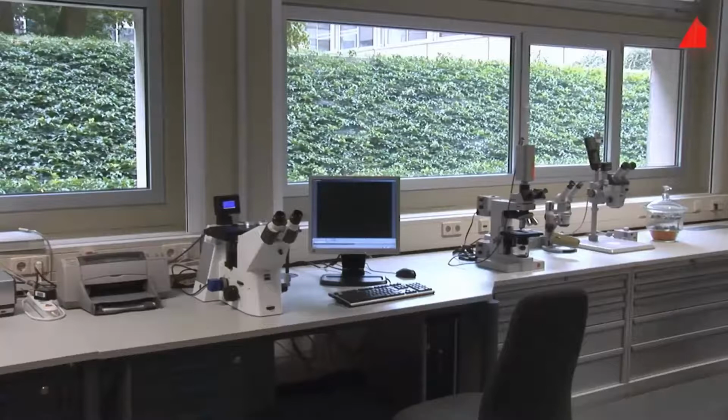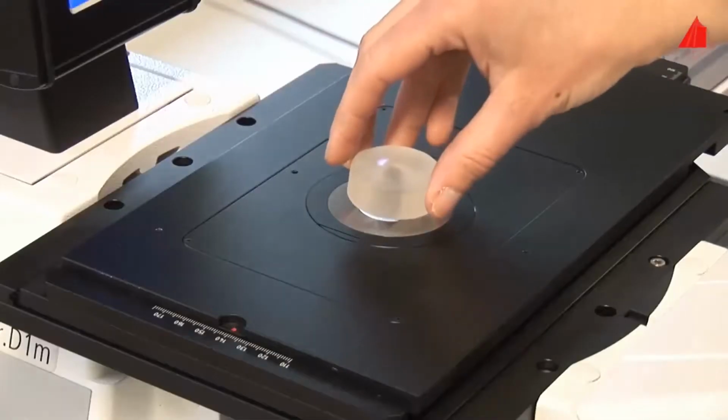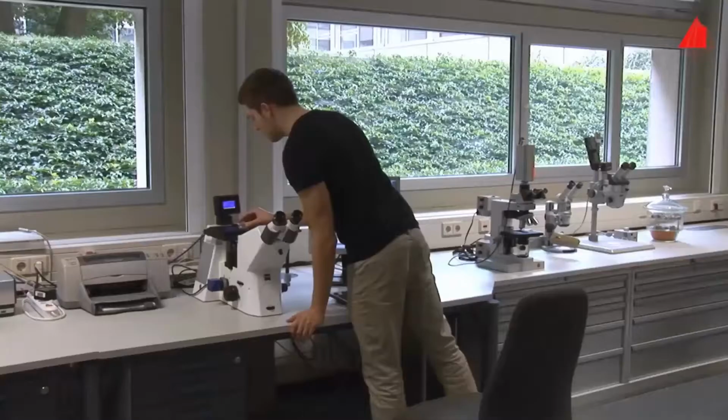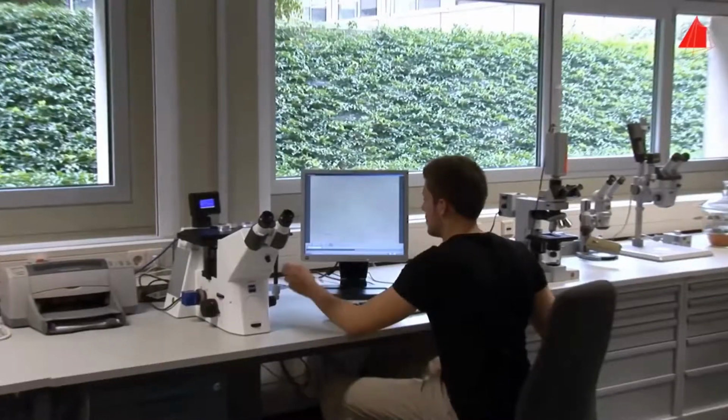It is now allowed to go under the microscope for the first time, or rather onto the microscope. In fact, the design of typical metallographic microscopes is inverted. Inverted means upside down. The microscope objective is not facing downwards as usual, but upwards. This offers the advantage of simply placing the metallographic specimen on top of the microscope stage. The prepared surface faces downwards.